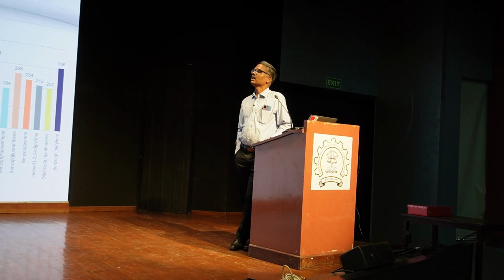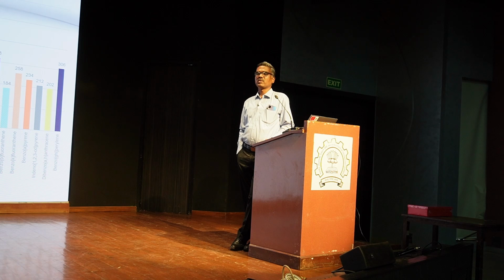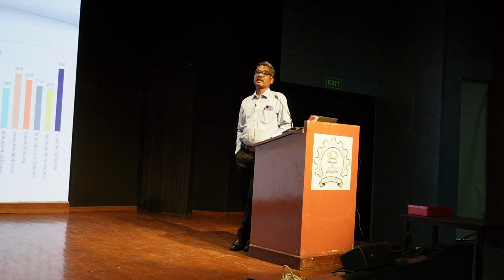Currently here we are using the QuEChERS extraction. QuEChERS stands for quick, easy, cheap, effective, rugged and safe, which is an acetonitrile-based extraction method, and it is very famous for multi-component extraction. You can take PAH and PCB as environmental contaminants, as well as pesticides, antibiotics and mycotoxins, and do the extraction by following the QuEChERS method. It is a very famous sample preparation approach in the food segment and environment segment.